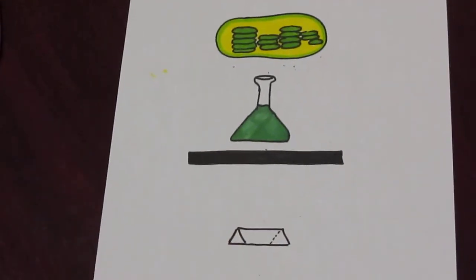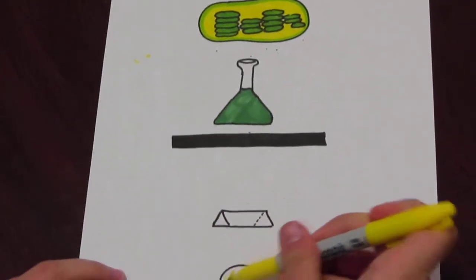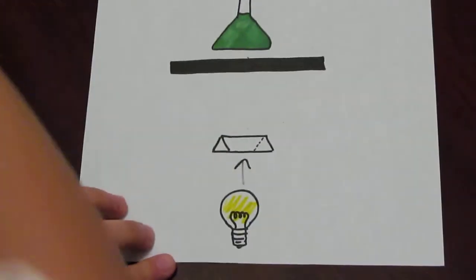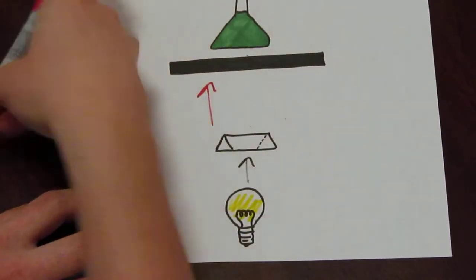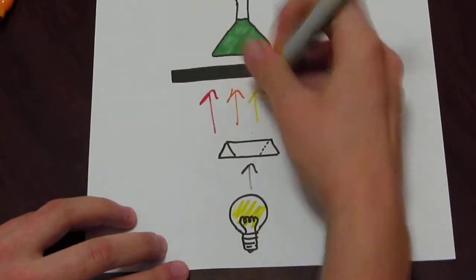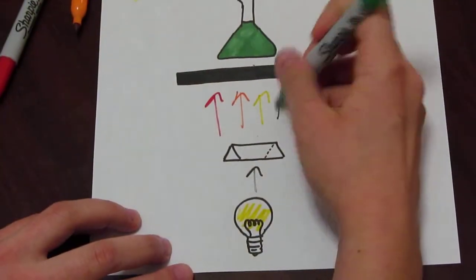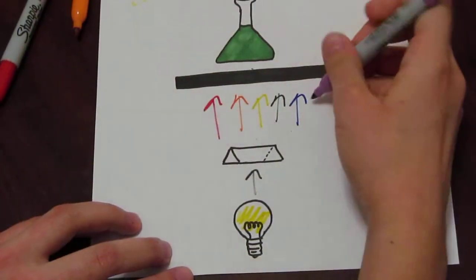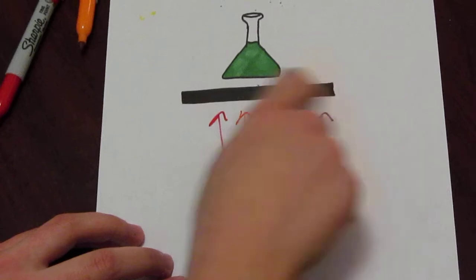So what we have here is a light source. When you turn the light on, the light travels through this prism where it diffracts into all the different colors of light, creating a pretty rainbow, and that passes through this slit.